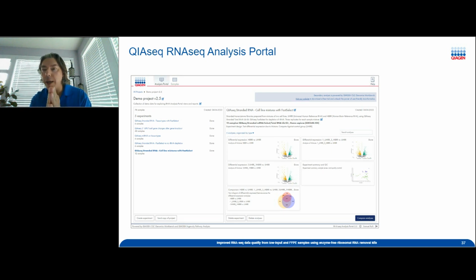After you do the alignment, you can go through and take those normalized gene expression values and compare them to whatever you want as many times as you want. And the idea here is that when we do the alignment, that's when we turn on the processors that we have sitting up in the cloud. That takes a little bit of energy and time. And then after that, when you have that flat file, which has the genes and the gene counts, it's a very small file, but you can use it as your experiments grow.